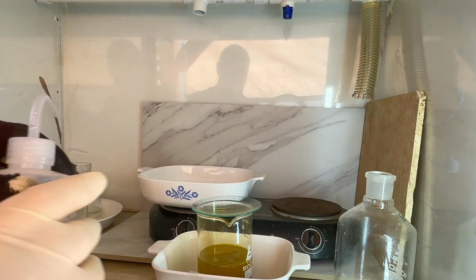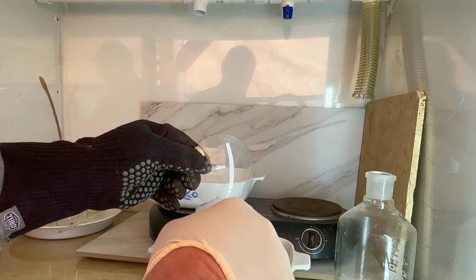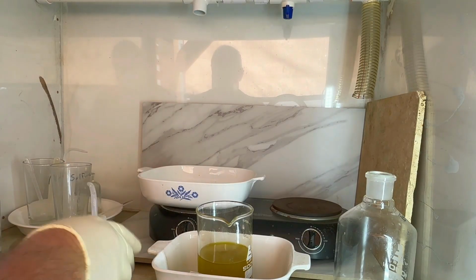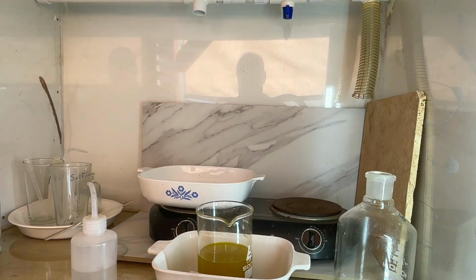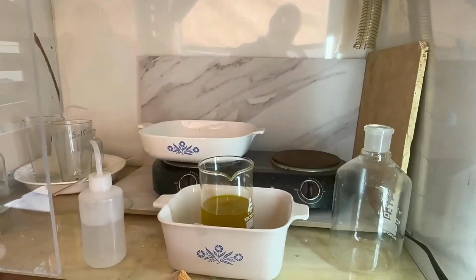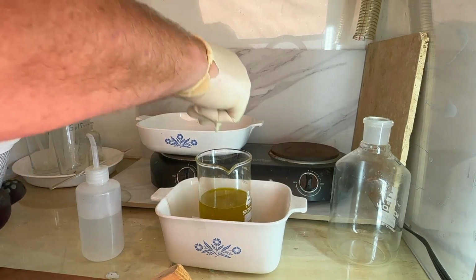So we've pulled our gold solution off the heat here. Everything's gone into solution. Fume production's dropped considerably, but we still probably have some excess nitric in here. So we're going to DeNOx this, and that's essentially going to remove our excess nitric. So we're going to bring in sulfamic acid, better known as grout cleaner at Home Depot. Sulfamic acid, however you want to say it.